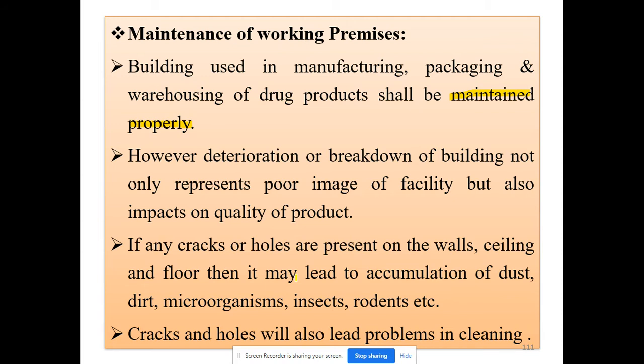However, student, try to understand, it becomes very essential that we maintain our working area in a sound manner, in a microbial-load-free manner, so that the quality of our product does not get hampered.